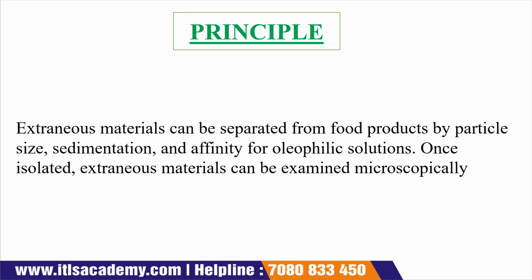Once it is isolated, we examine this extraneous material with the help of a microscope, because it cannot be seen by our naked eye. That's why we use the microscope for visualization.